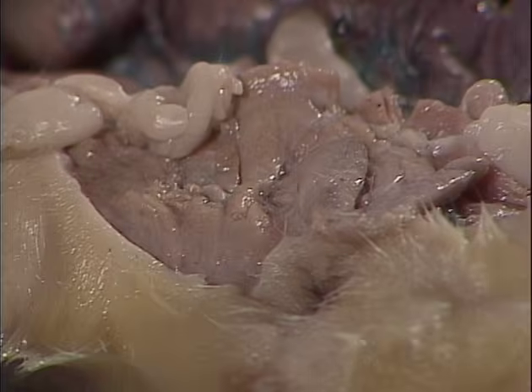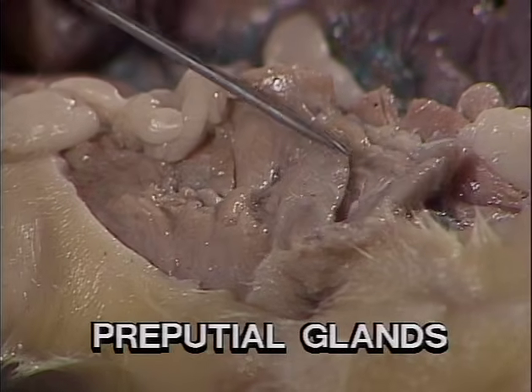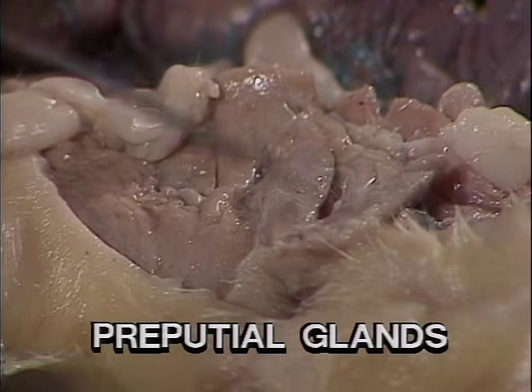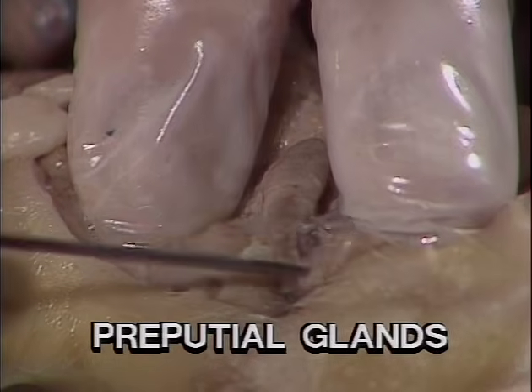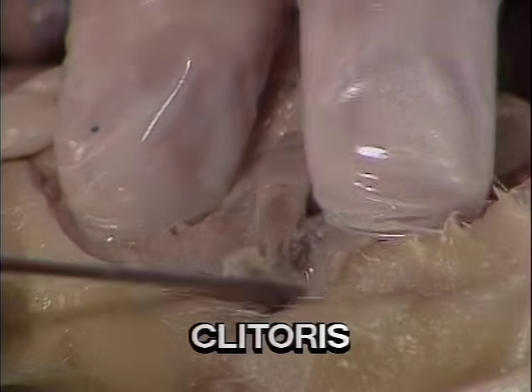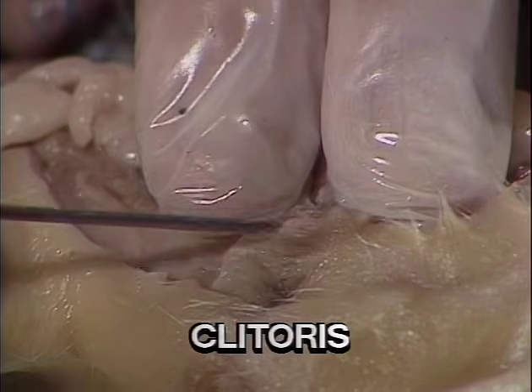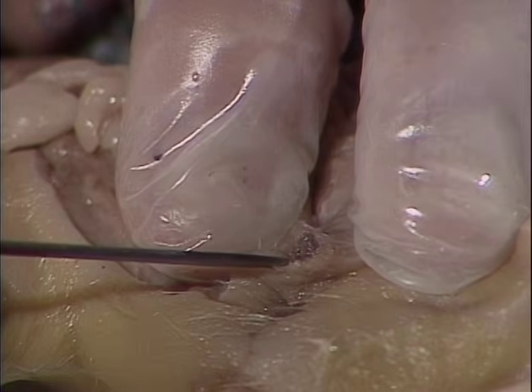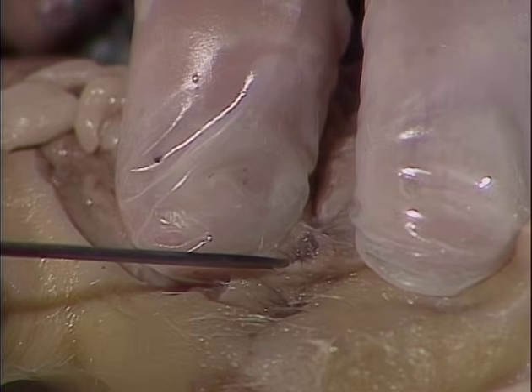The female also has some preputial glands located here on either side of the urinary opening. Also located here is the clitoris. This is similar to the penis in the male. This ends the reproductive structures of the rat.